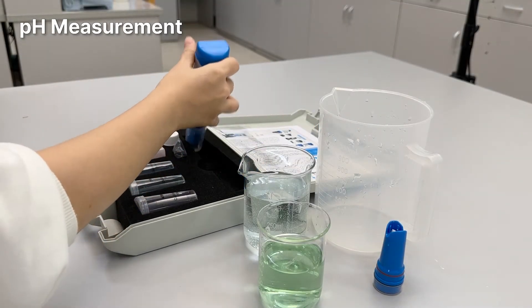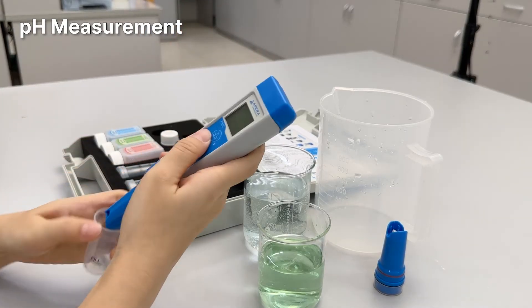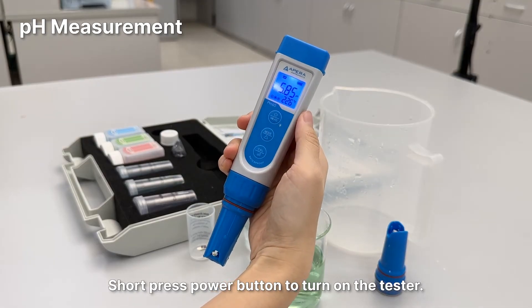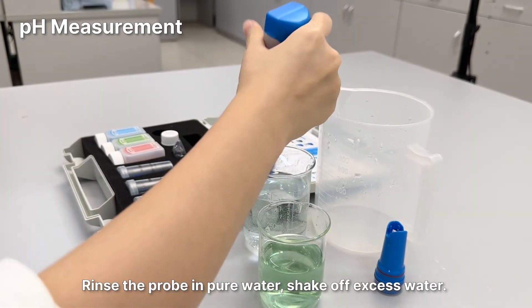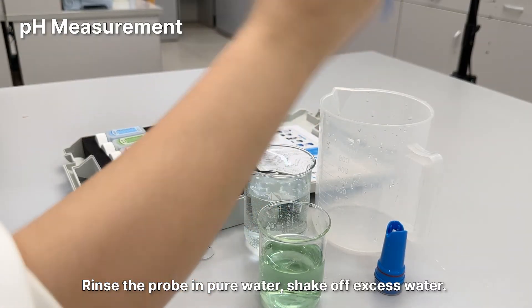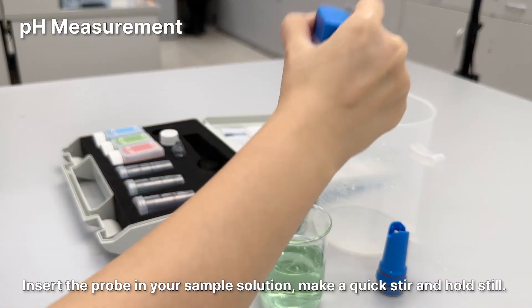pH measurement: short press the power button to turn on the tester. Rinse the probe in pure water and shake off excess water. Insert the probe in your sample solution, make a quick stir, and hold still.